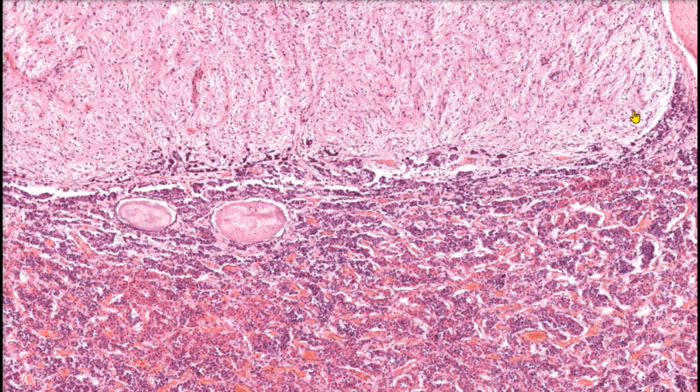The posterior pituitary, which we can see back here, also known as the neurohypophysis, is mostly composed of unmyelinated axons. It stains lighter in color because it's composed of nervous tissue. Now, the key thing to remember about the posterior pituitary is that it does not produce its own hormones. Instead, it releases 2 hormones produced by the hypothalamus. Those hormones are antidiuretic hormone and oxytocin.